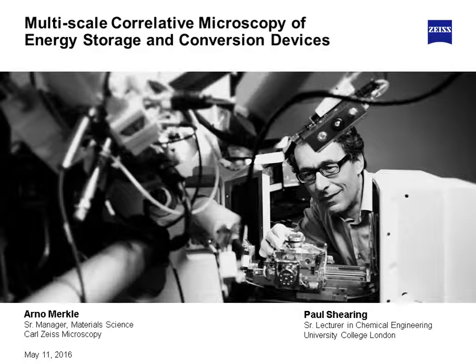And apologies, I didn't have a chance to go into that in any detail. Typically, for a porosity calculation, we'll take the three-dimensional image, perform some binarization of that image to say what is the solid phase and what is the pore phase, and then it's just a simple question of doing a pixel counting or voxel counting algorithm to work out what the porosity is. But once that binarized image is in your working environment, there is a really huge variety of different microstructural metrics that can be extracted.